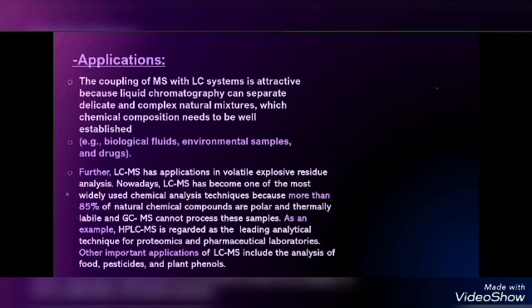Nowadays, LCMS has become one of the most widely used chemical analysis techniques because more than 85% of natural chemical compounds are polar and thermally labile, and GCMS cannot process these samples. As an example, HPLC-MS is regarded as the leading analytical technique for proteomics and pharmaceutical laboratories. Other important applications of LCMS include the analysis of food, pesticides, and plant phenols.